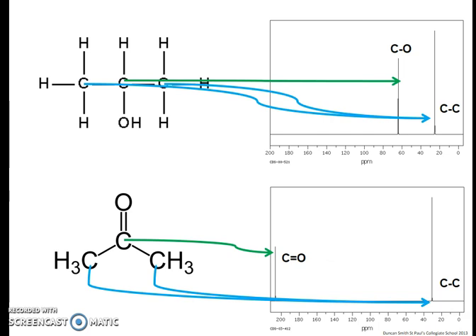So simply looking at those two spectra will allow you to distinguish between those two compounds.